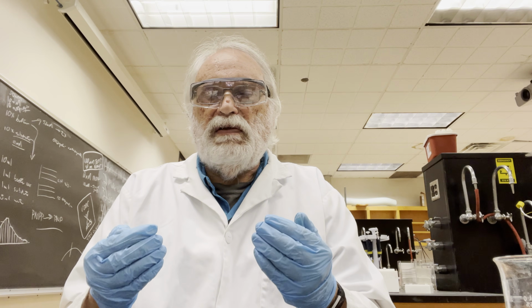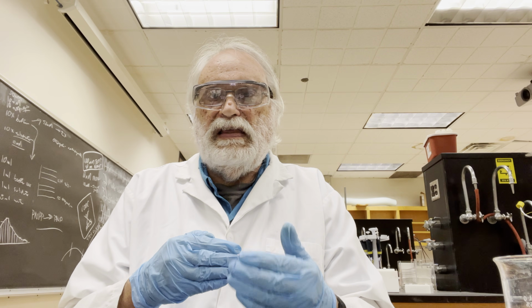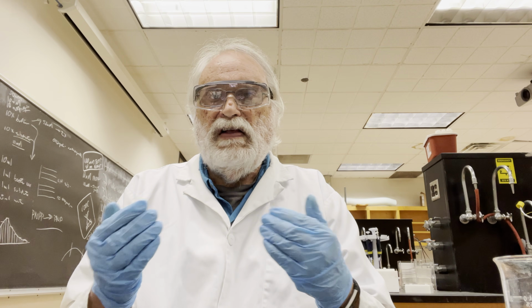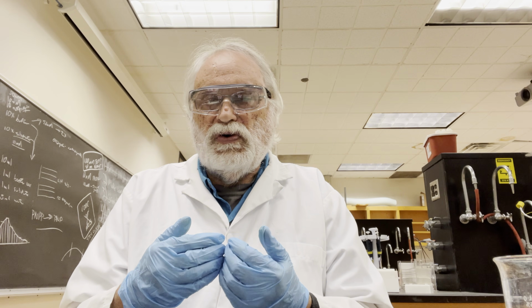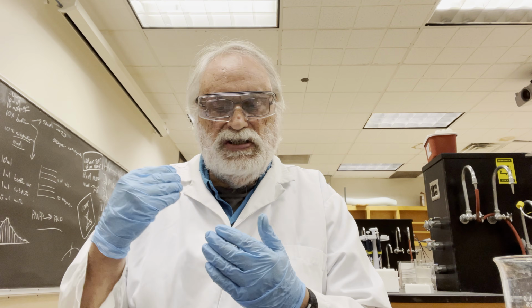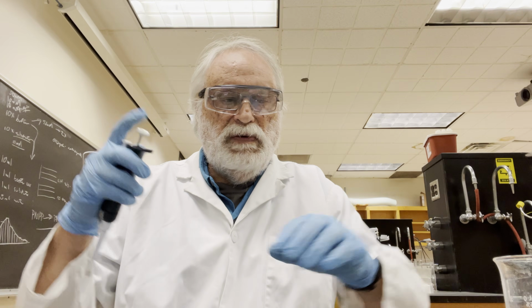So we'll do that, and we'll be able to compare between days and talk about how the activity of the mutant may or may not be greater or lesser than the wild type. So the first step is to do the protein assay. What we're going to do is put the samples on the plate just the same way we did for the enzyme assay. Here we go.